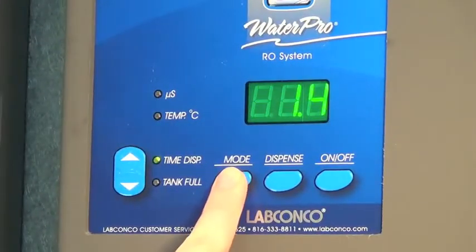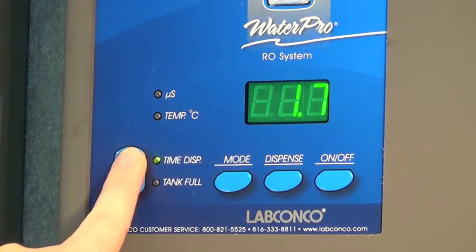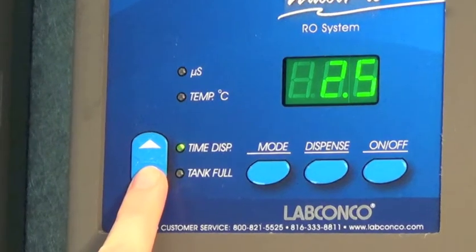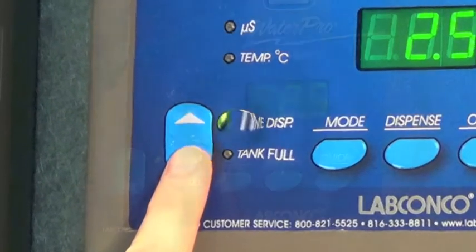Selecting time dispense allows the user to increase or decrease the amount of time in minutes the system will dispense water from its dispense valve. Use the arrow keys to adjust the time dispense setting.